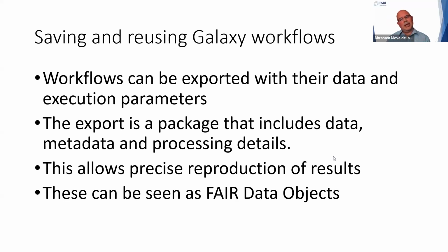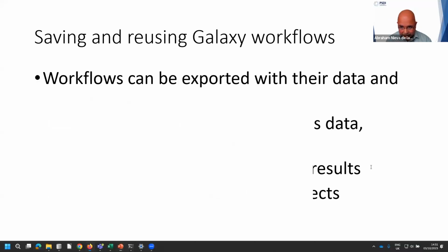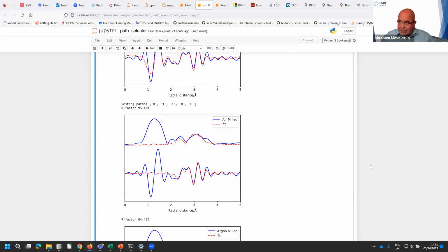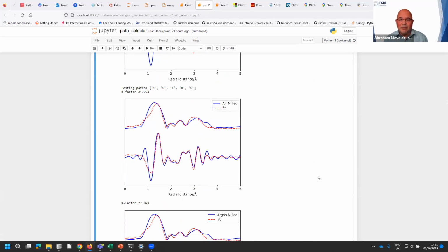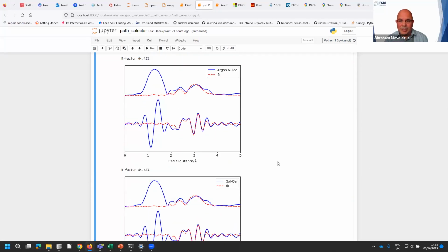Variants of the fits. Well, that's again something that I cannot answer as an expert on EXAFS analysis. So for me, visually, this is a bad fit because it doesn't represent the first hump, and its R factor is high.